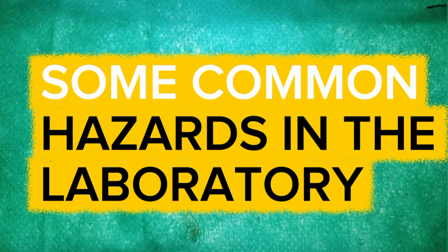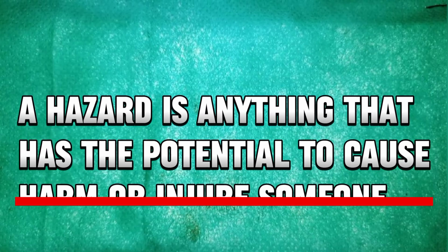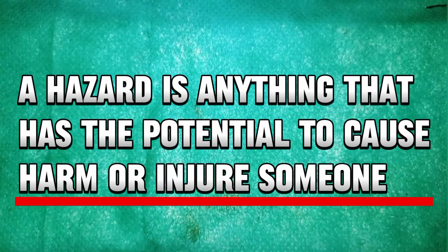Common laboratory hazards and their symbols. What is a hazard? A hazard is anything that has the potential to cause harm or injure someone. In pre-technical standards, we say that a hazard is a situation that can cause harm, discomfort or sickness to oneself and others.